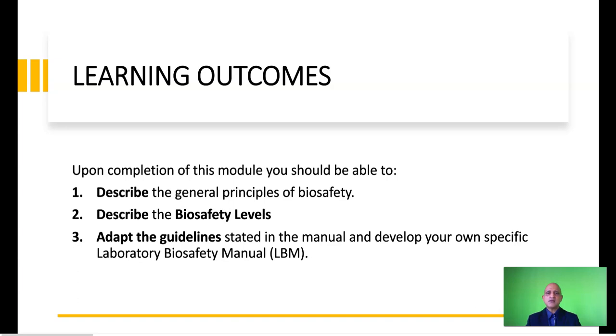module. You should be able to describe the general principles of biosafety, describe the biosafety levels, there are four biosafety levels, and adapt the guidelines stated in the manual and develop your own specific laboratory biosafety manual. The reason I have done this is because each laboratory has to develop its own biosafety manual based on the localized conditions as well as on the biosafety policy of the respective institution.